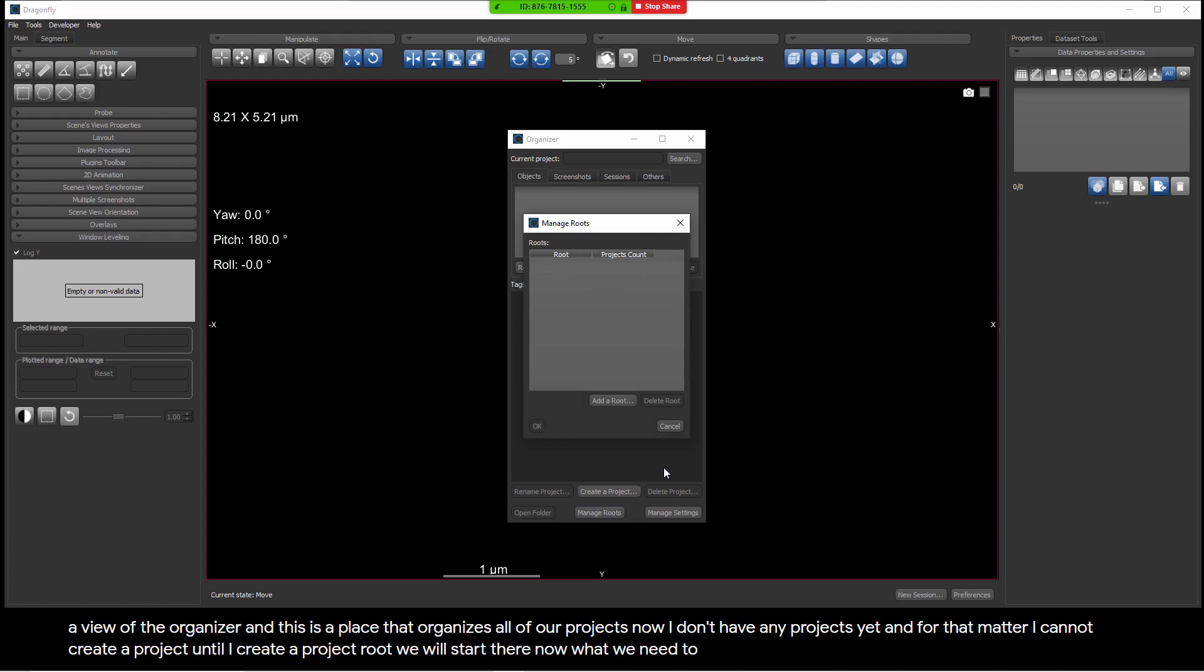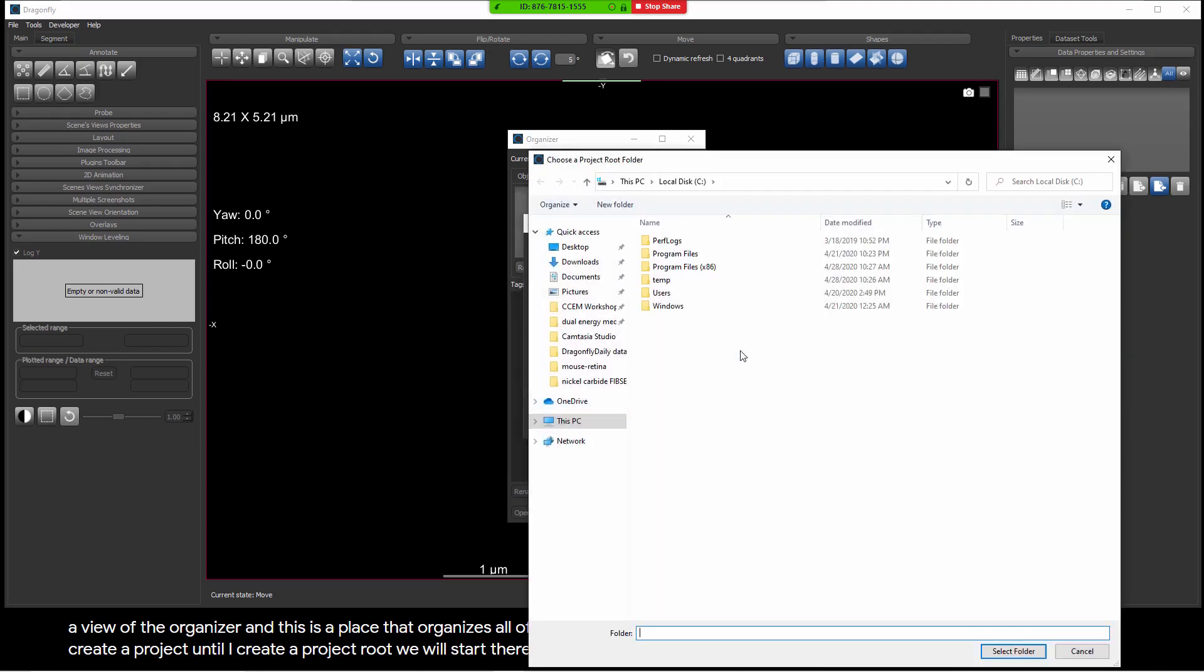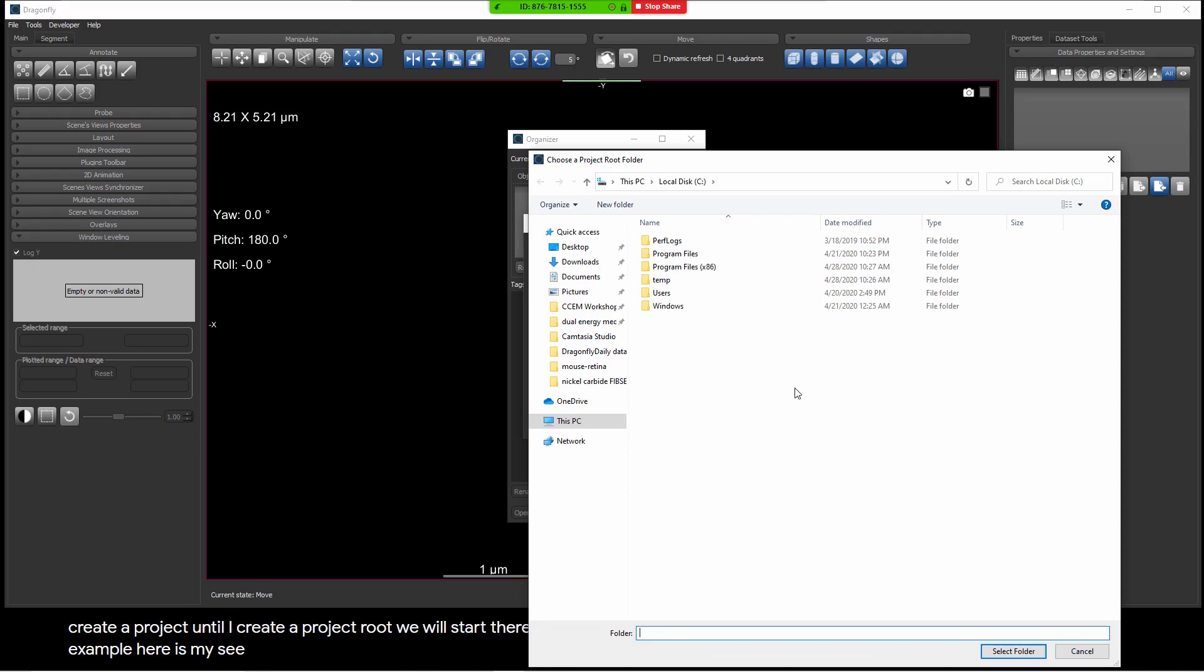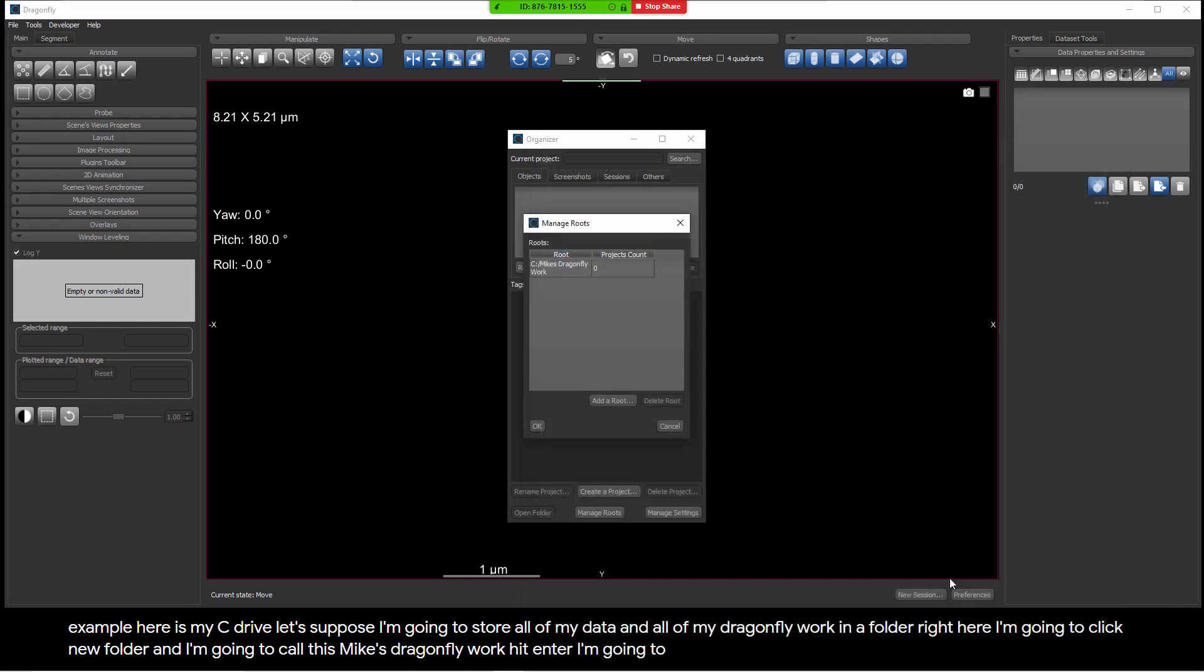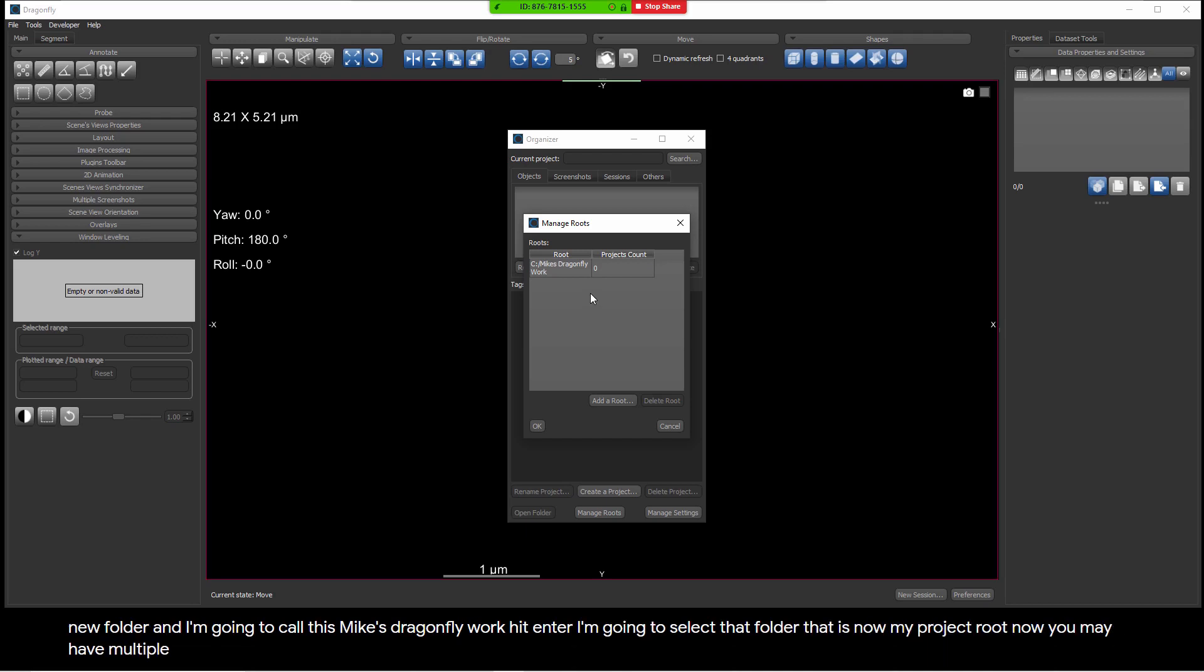What we need to do is we would normally click on Add Root. For example, here is my C drive. Let's suppose I'm going to store all of my data and all of my Dragonfly work in a folder right here. I'm going to click New Folder, and I'm going to call this Mike's Dragonfly Work, and hit Enter, and I'm going to select that folder. That is now my project root.